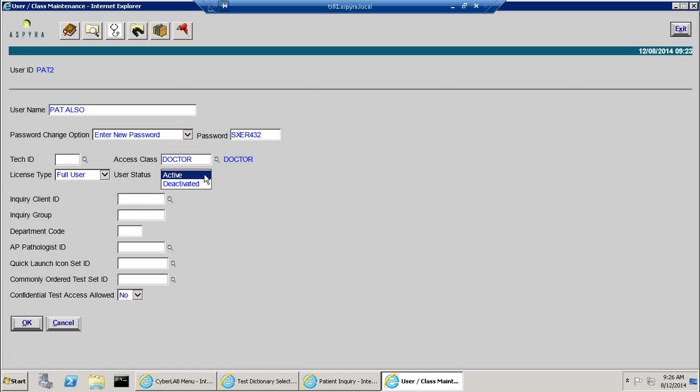You cannot delete a user, because if that user was used and did some activity, you need to keep that recorded for your history information and your logging information.